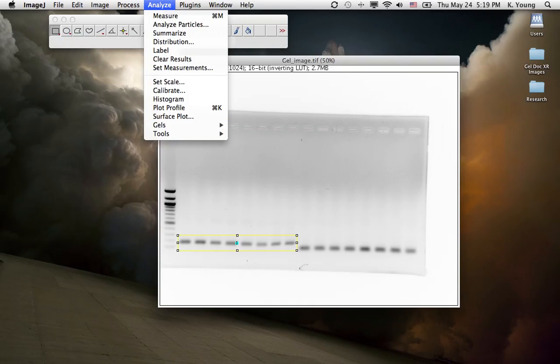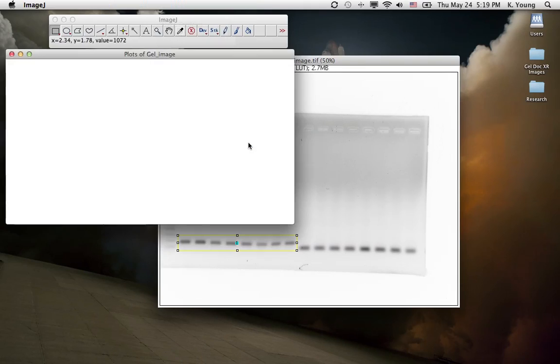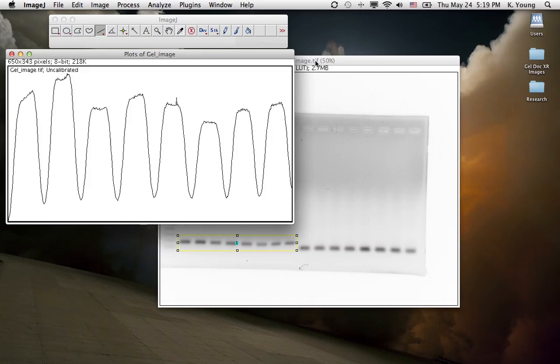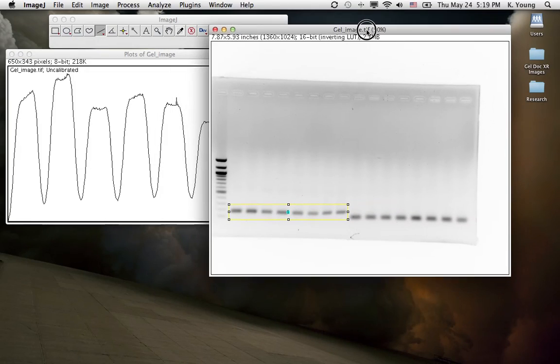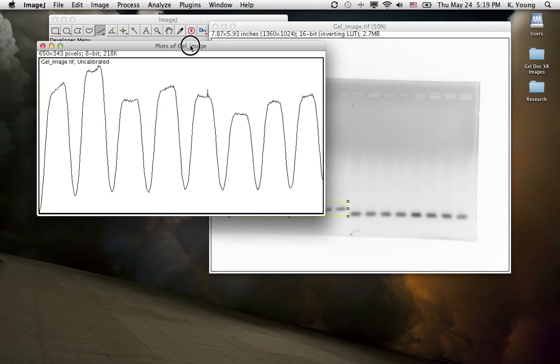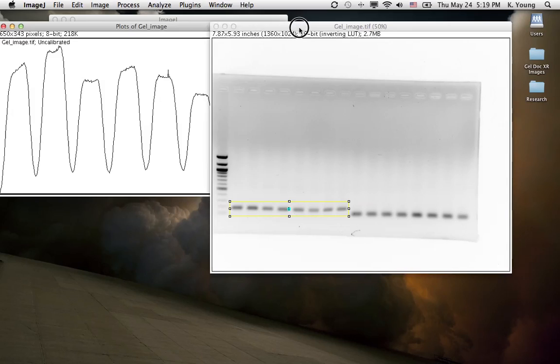Go to Analyze, go to Gels, and then go to Plot Lanes. And here we have the plot of our gel image.